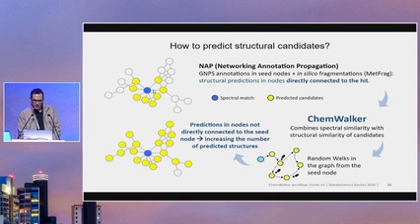The candidates connected to the node show if these are protonated. The analog is also protonated. If there is a sodium adduct, it's in another cluster, not here, right? You can observe adducts in other clusters with sodium, potassium, among others.